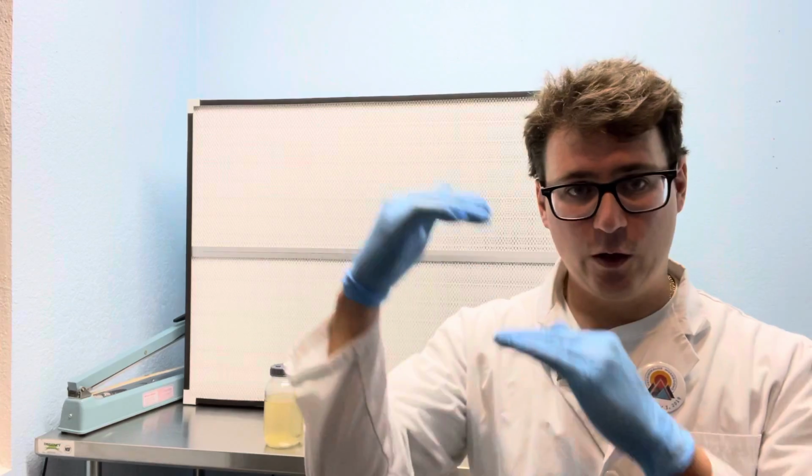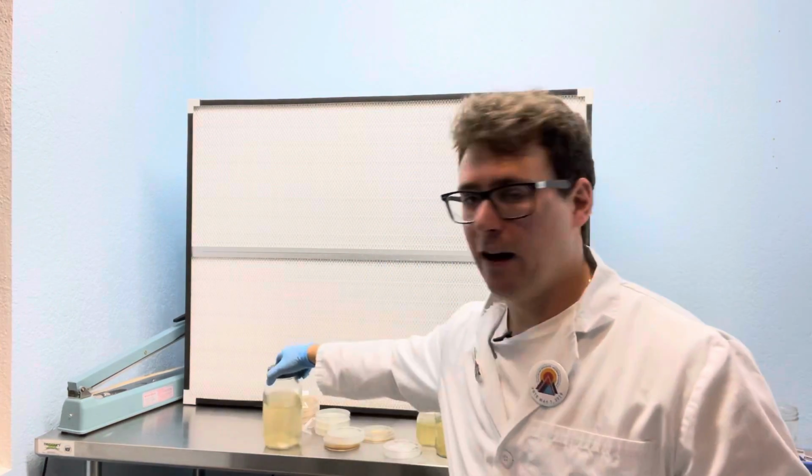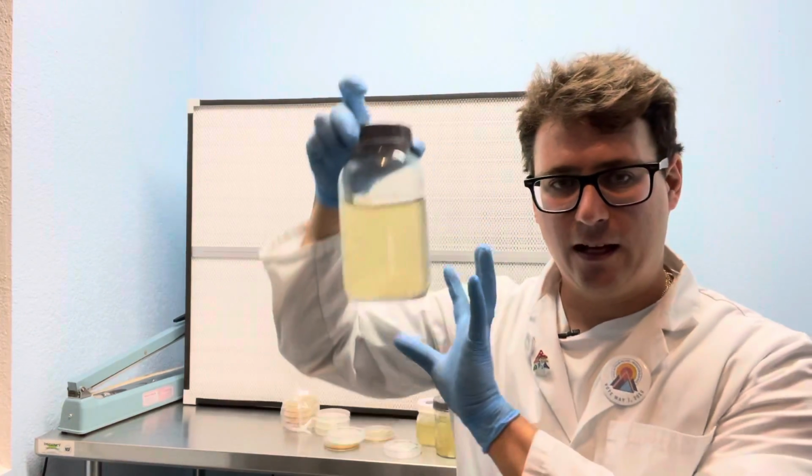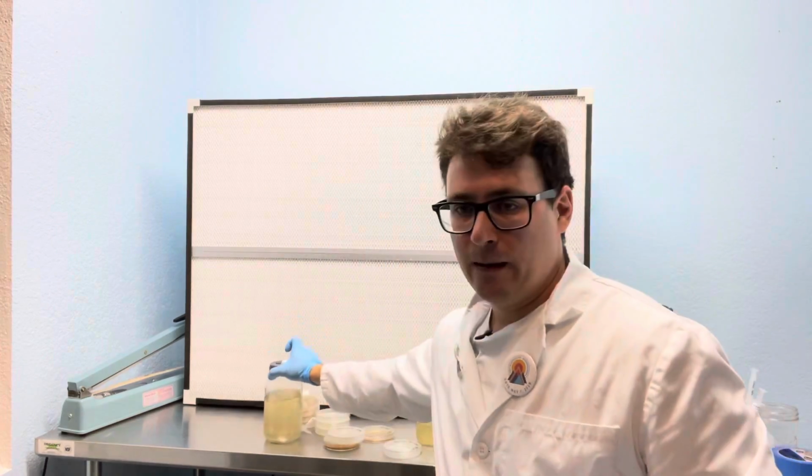So far we've gone through the rate of growth on agar versus liquid culture, where the liquid culture allows for three-dimensional growth at a faster rate. Then we got into the different visualization aspects of a liquid culture versus an agar culture. Agar is a two-dimensional surface which allows you to observe contamination, whereas with a liquid culture, you can observe contamination by the clearness of the solution.